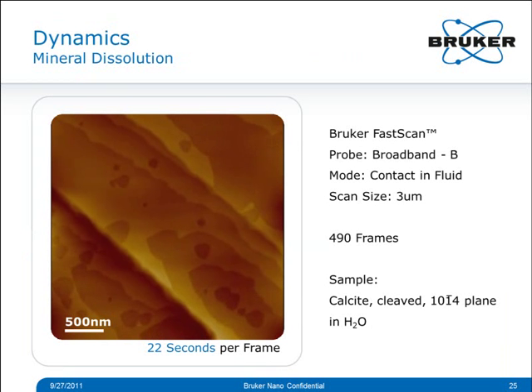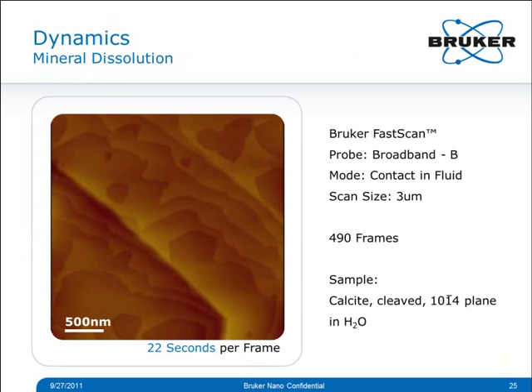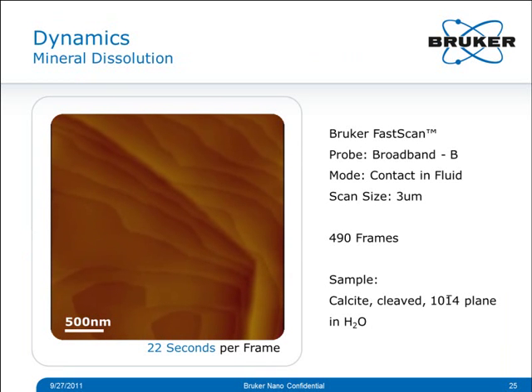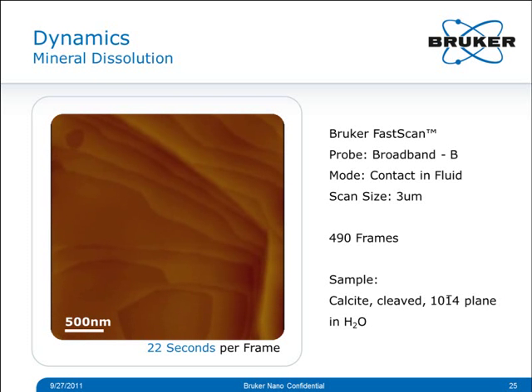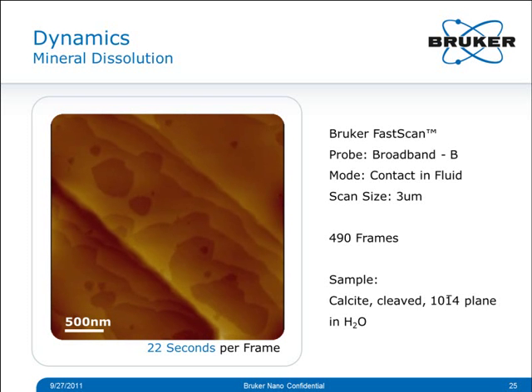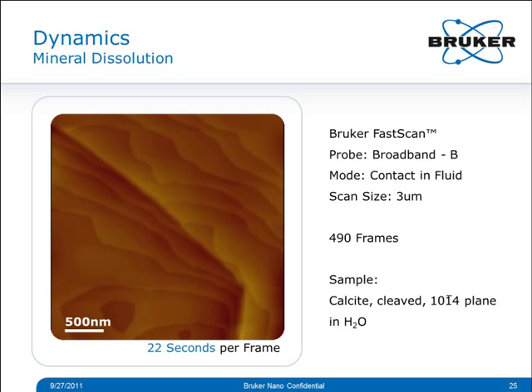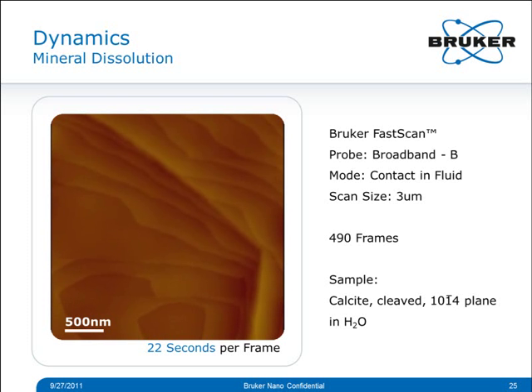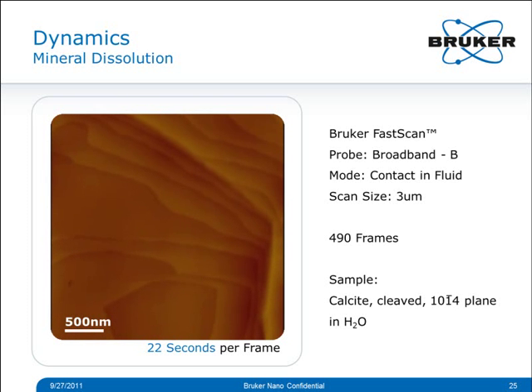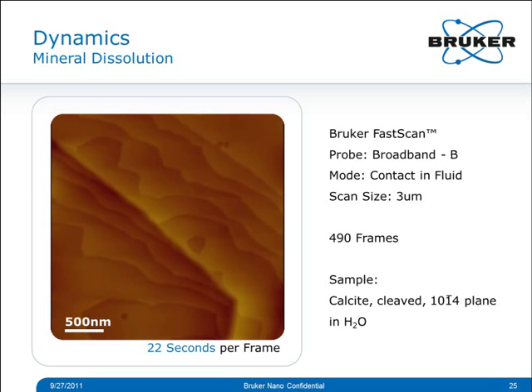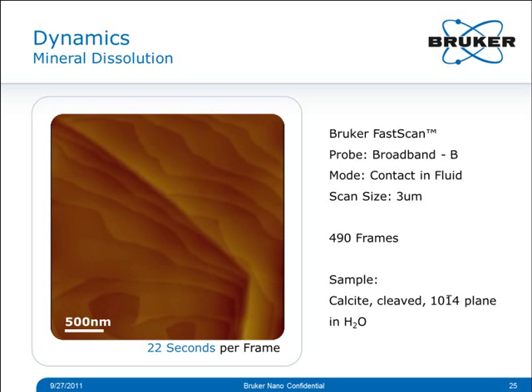Here is a quick example of dynamic imaging in mineralization. This is a freshly cleaved calcite crystal surface in water, showing dissolution of the calcite. The scan size is 3 microns; the individual crystal planes dissolving are less than a nanometer high. Each frame was taken in 22 seconds and the overall movie consists of 490 frames. Mineralization and demineralization processes at the nanoscale are relevant for modeling biomineralization processes, during which organisms control mineralization through protein expression and nanoscale interaction with a mineral. Similarly, dissolution, oxidation, and erosion processes of inorganic solids are widely relevant for applications ranging from corrosion resistance to drug dissolution.